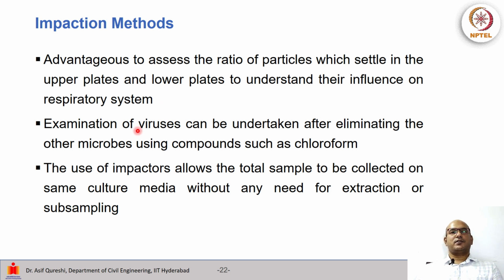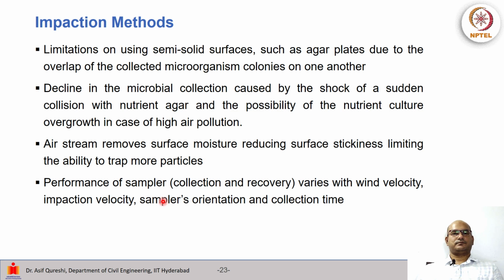Then examination of viruses can also be undertaken after we eliminate the other microbes by using compounds such as chloroform. So we will be able to get rid of the influence of other microbes and just do the analysis of viruses. The use of impactors also allows the total sample to be collected on the same culture media. So we do not need any subsampling, or any, so to speak, extraction.